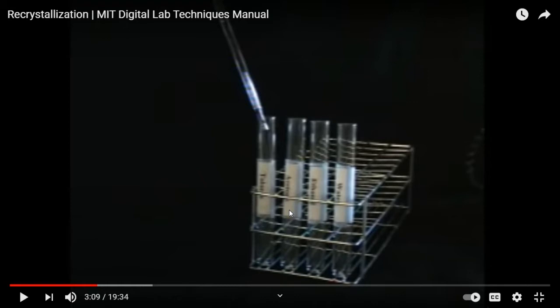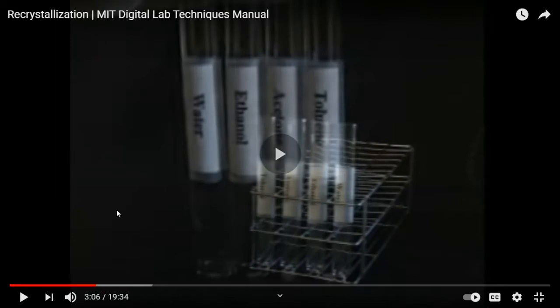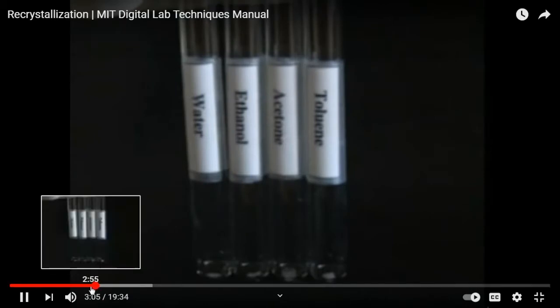Whatever you do in the future, if someone says a solubility test of a solid, then you should remember this number. Add a half of a milliliter of the appropriate solvent and swirl. Wait a couple of minutes and then make note of the result.